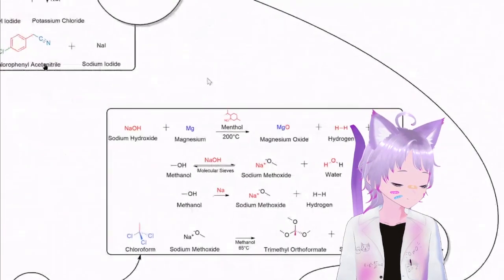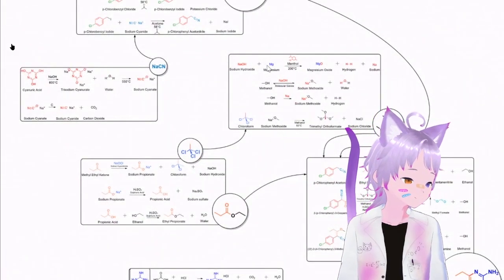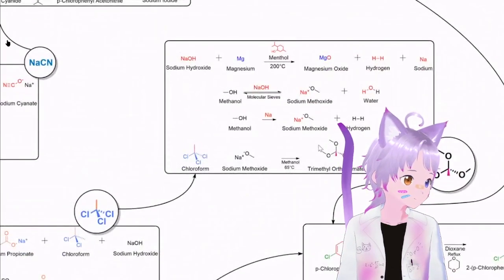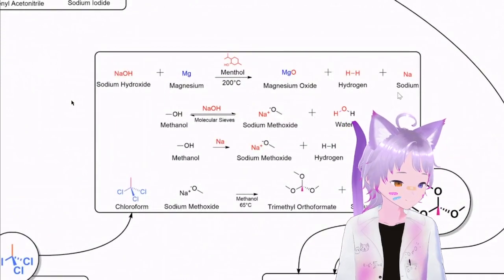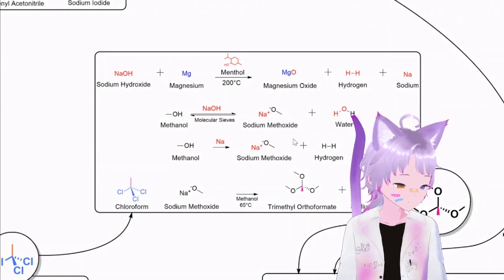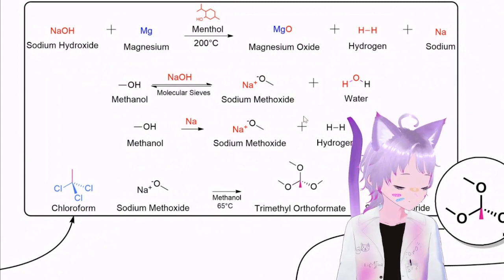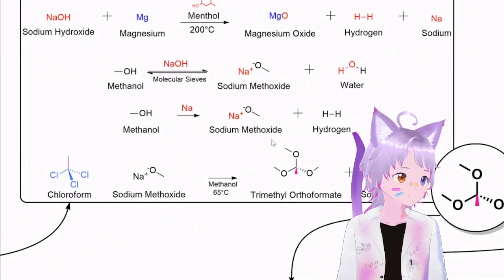Okay, what next? You there? Hello. I'm here. Well, next would be sodium hydroxide, magnesium, but I'll skip this one because I don't really need to do that. Methanol on molecular sieves to make sodium methoxide. Molecular sieves would actually absorb water and push your reaction forward to form methoxide, but sodium metal is always better.